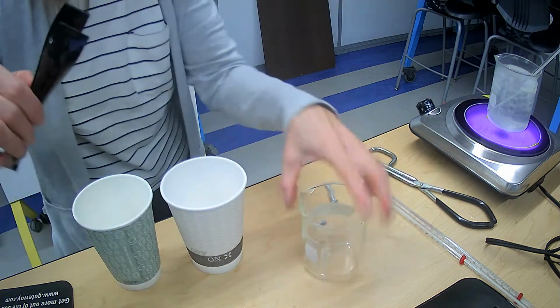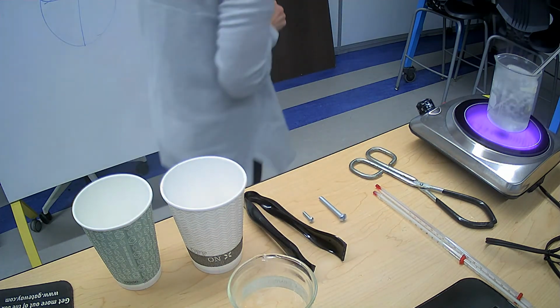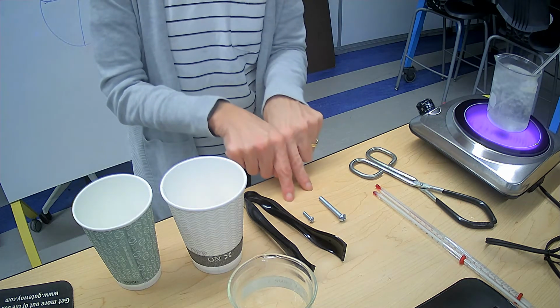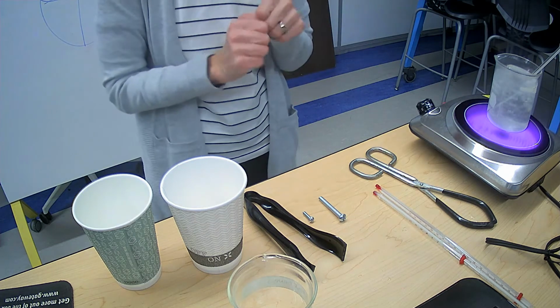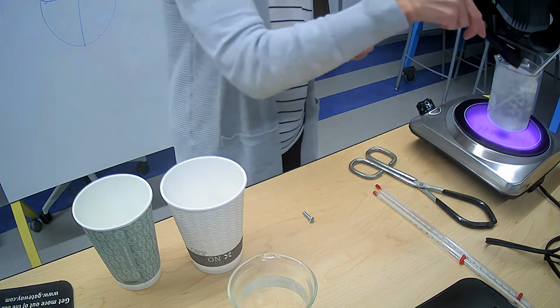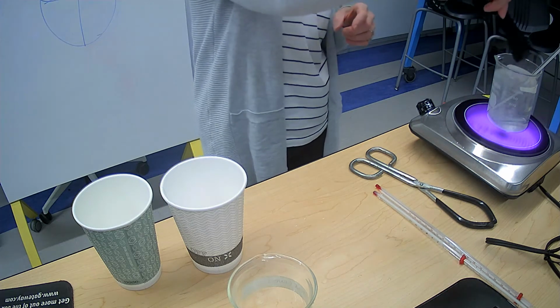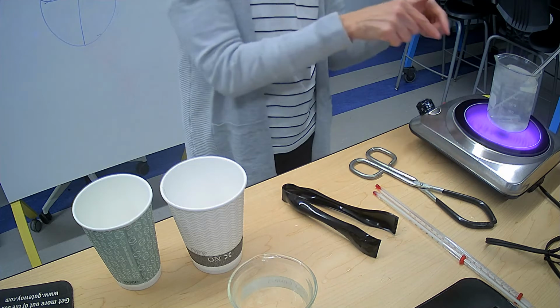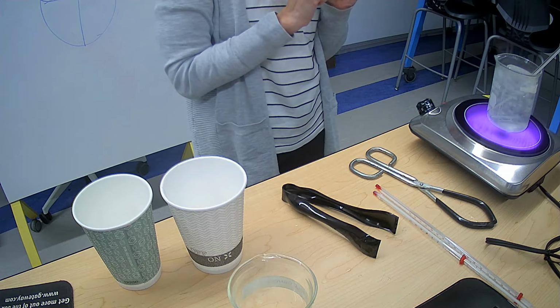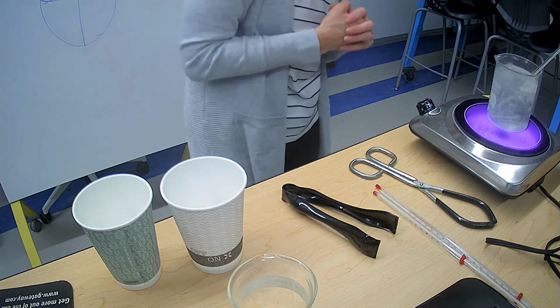I also have these two metal bolts, and notice their sizes. We're going to mass them, so I'm going to tell you the mass of them just in a few minutes, but I'm going to get going with the temperature part of this, okay? So we'll get the masses in just a minute. I'm going to place the bolts into the beaker very carefully. We're going to let that get to be the temperature of the water. So by being in the water, it is the same temperature as the water. So the water is transferring its energy to the bolts, okay, making the bolts super hot, 100 degrees Celsius.